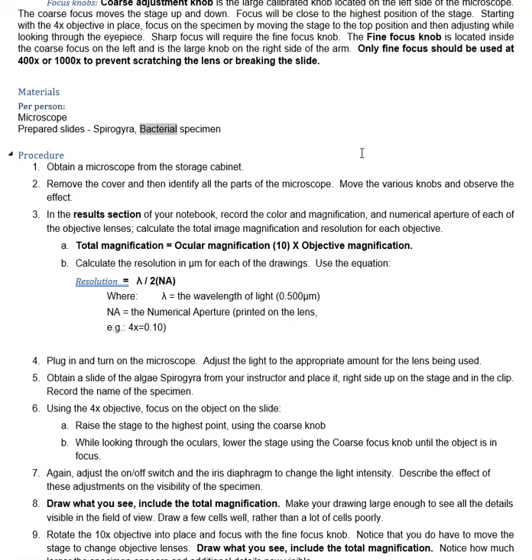If you put too much light, it's just going to white everything else. It's going to be glare, and you're not going to see anything. At this point, although to be honest with you, on the 10X you probably won't need to do much with the iris diaphragm. Once we've got everything perfect, then we go up to the 40X, and we do the exact same thing.